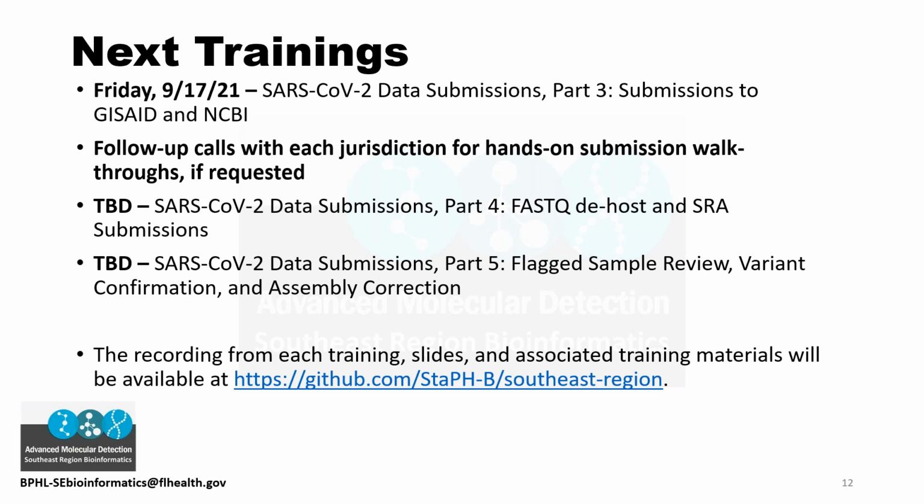But if you're using something that I was unaware of and the script's not working properly, let me know, and I can make those edits to make sure that it works with your script. Some pipelines will format their FASTA headers differently, or their file names differently, so we'll just make sure that everything works.